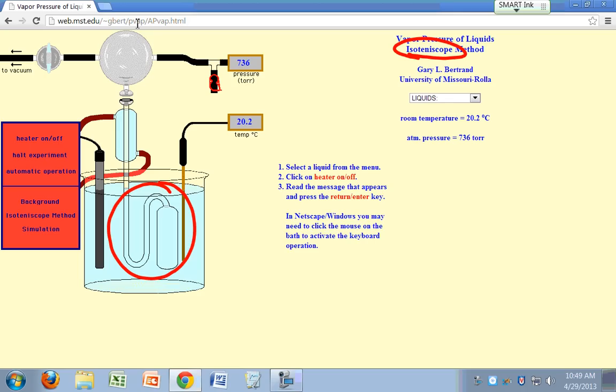What you're going to do is put a liquid in here, so you're going to put liquid in here and liquid in here. So you have a liquid there and a liquid there.